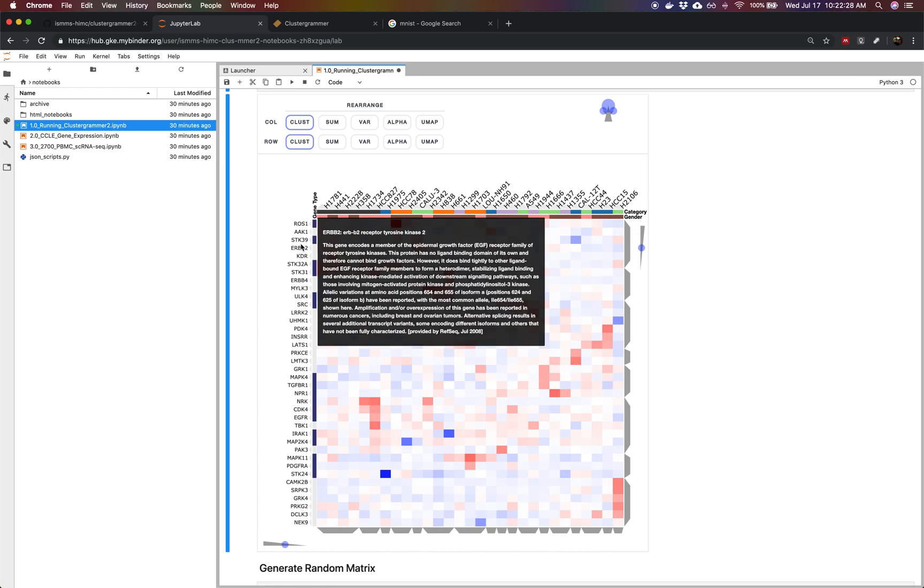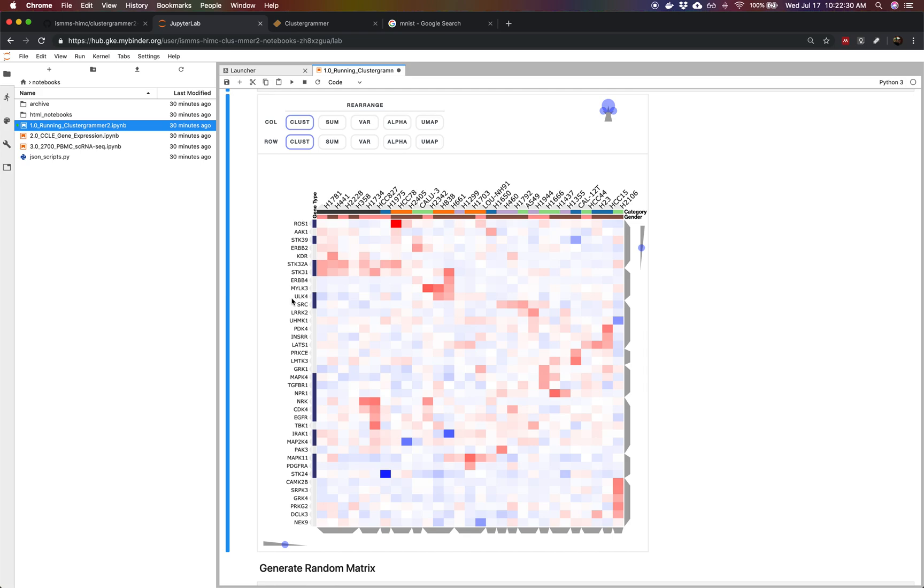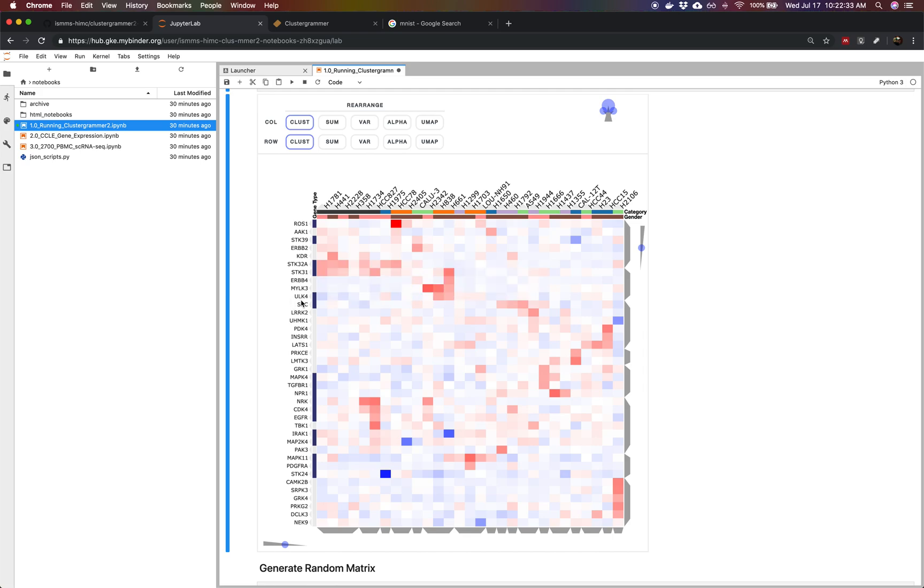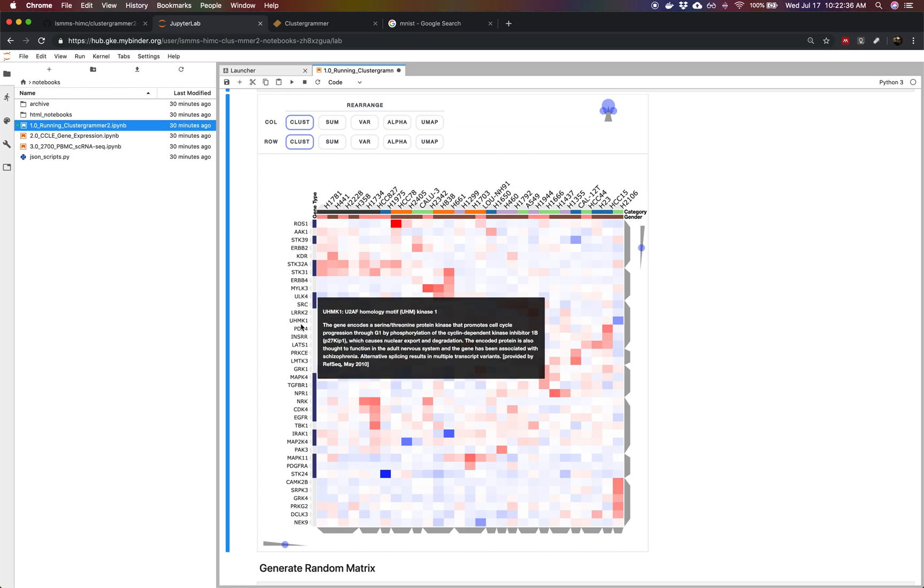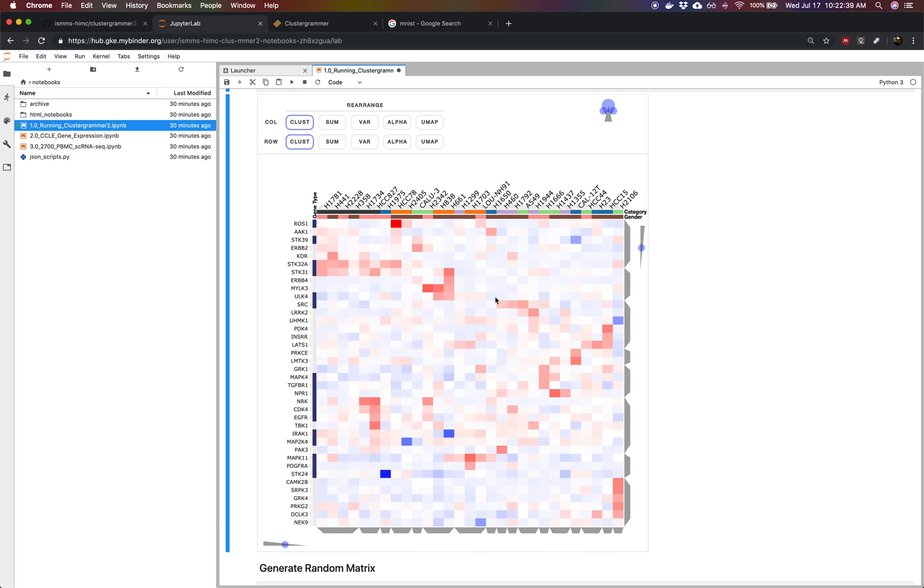You can start to play around with the interactivity of ClusterGrammar. You can hover over gene names. It will look up the gene, the full name and RefSeq information from a tool called Harmonizome. And you can also reorder your data.